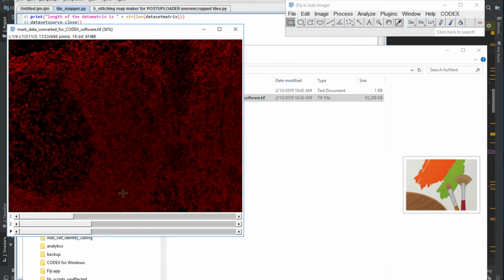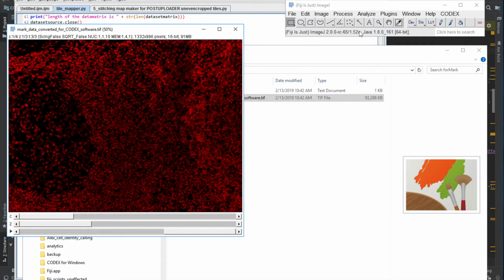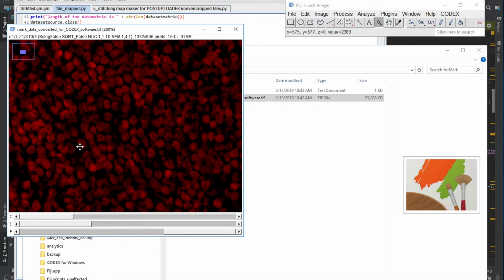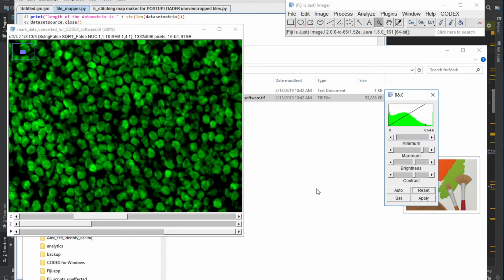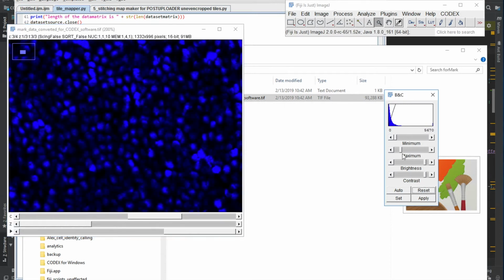You will see it created a third frame, right? That's how your nuclear signal looks now. So it actually has two kinds of transformation. It did both sum in the first two channels, right? And division in the third and fourth.